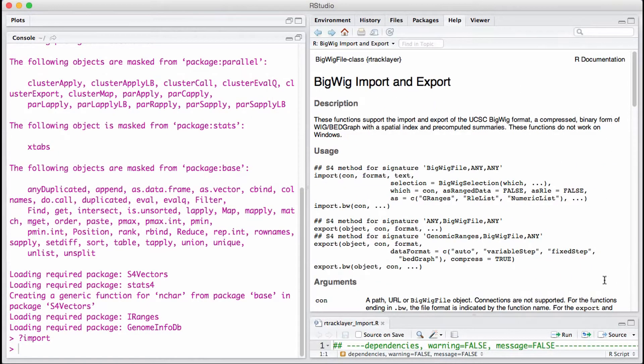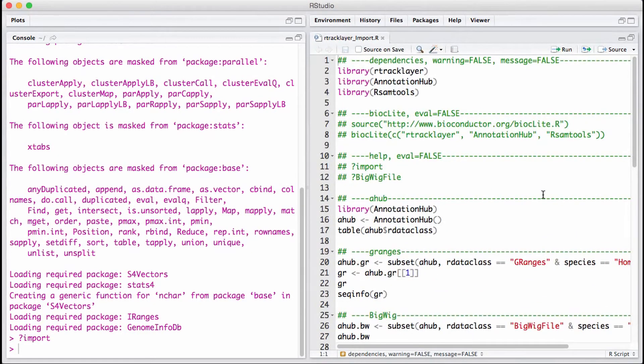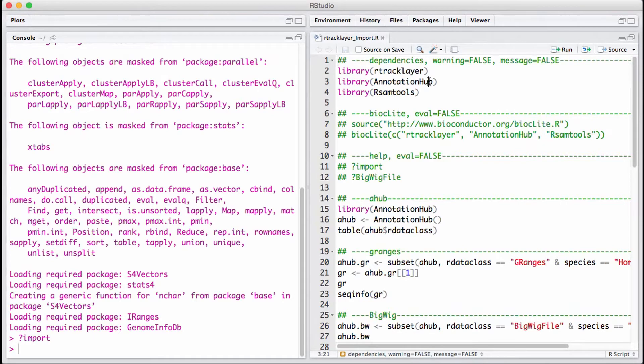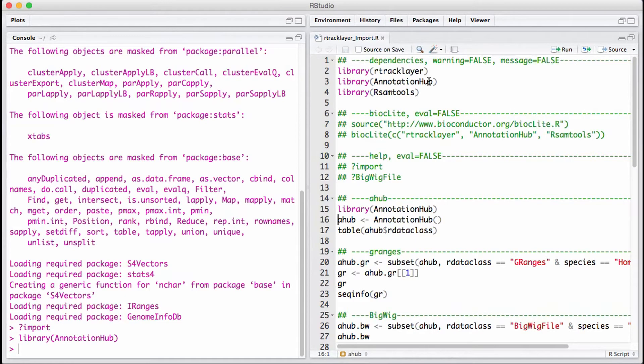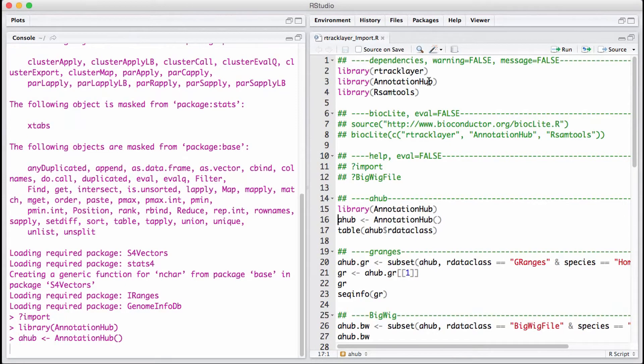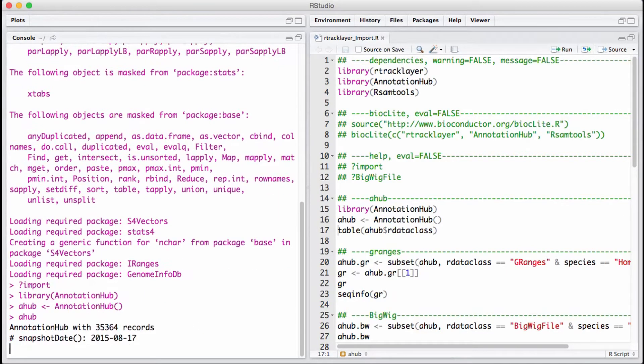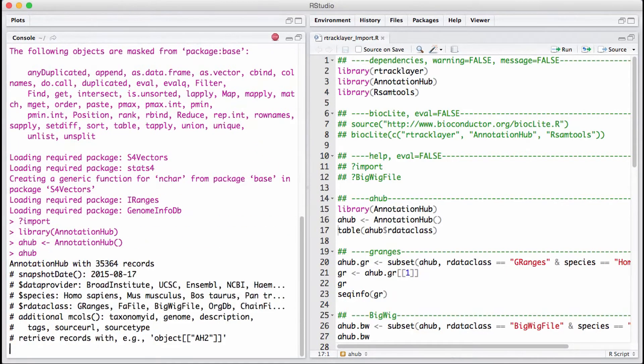Let's get a bigwig file. We're going to use a function known as AnnotationHub. You define it using a variable, and when you type in the variable ahub, this is what you get.